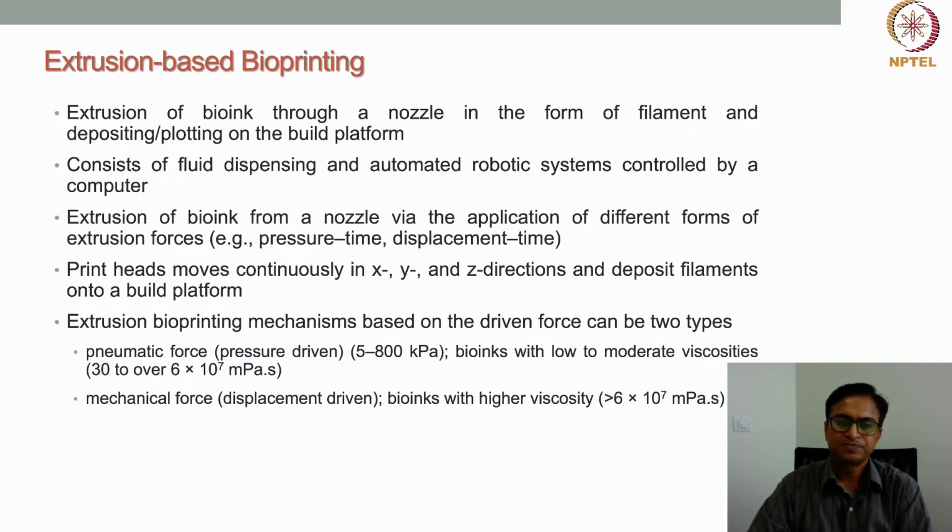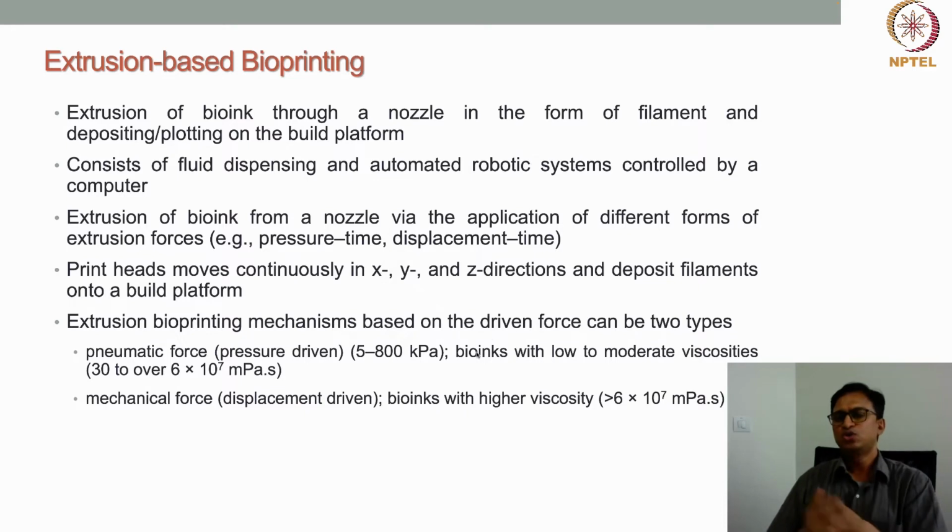Then, as I already mentioned, the driving force for extrusion can be either pneumatic, that is pressure driven, in the range from 5 to 800 kPa of pneumatic pressure. With this kind of system, bioinks of low to moderate viscosity, in the range of 30 to 6 times 10 to the power 7 millipascal second, can be used.